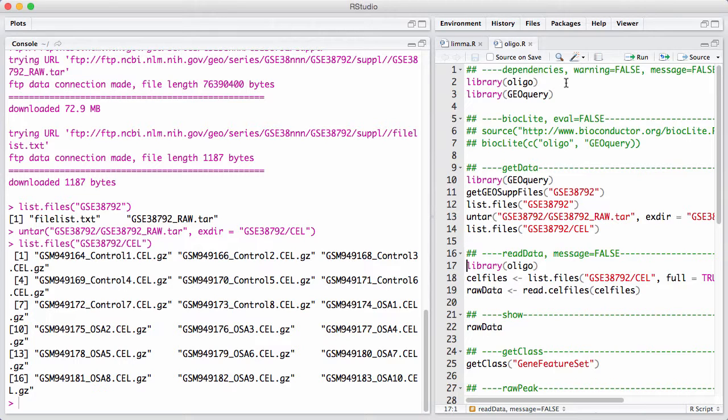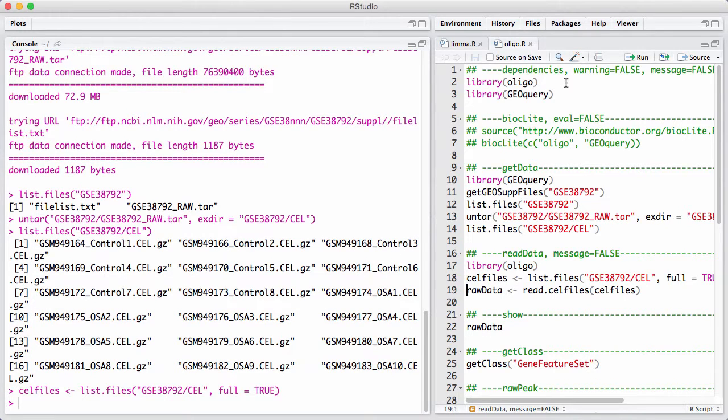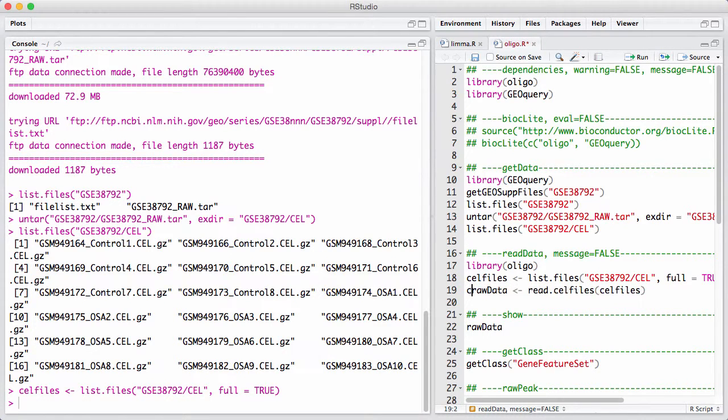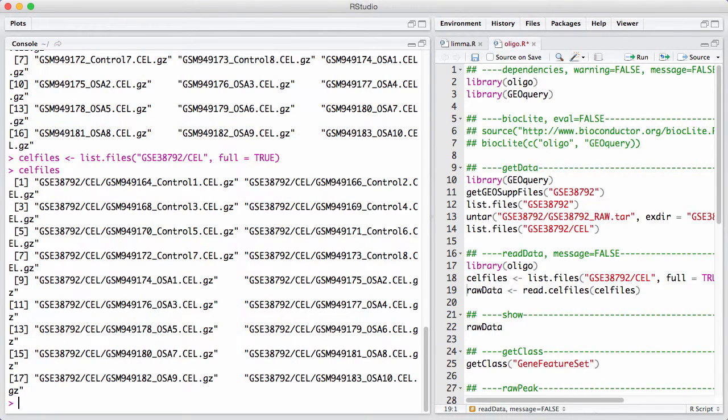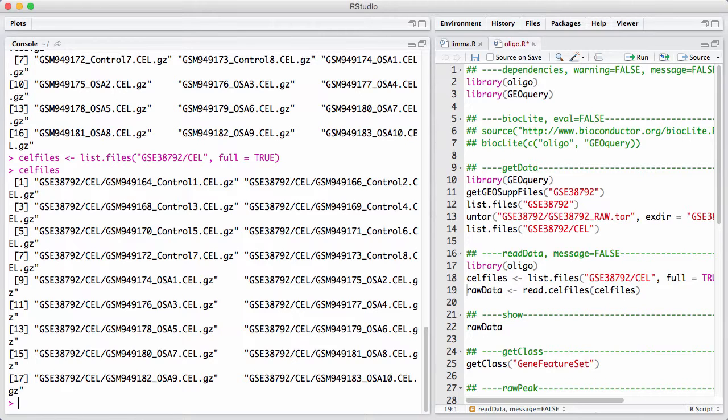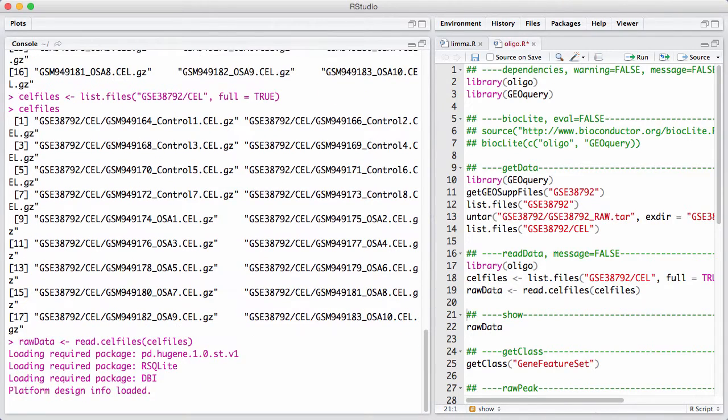We obtain a list of our CEL files with the full name. All we have here is just a list of these file names here with the full path to it. And then, as we often have in Bioconductor, we have convenience functions that read this data into a data container. Let's execute this.